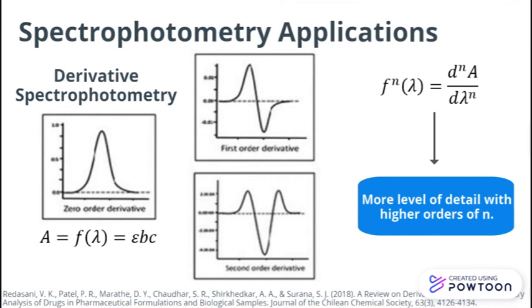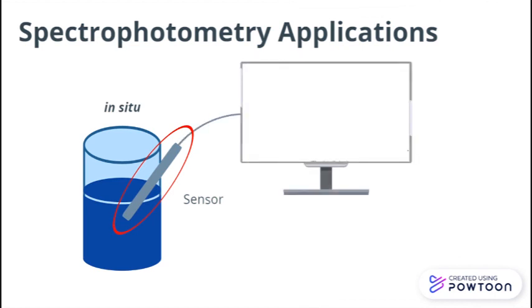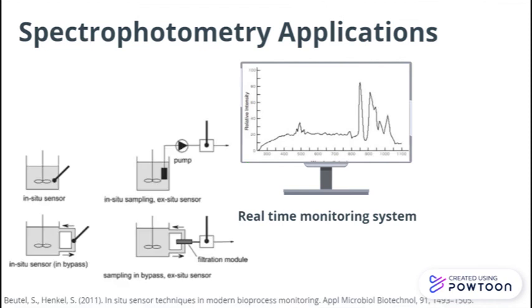Finally, novel in situ applications take advantage of these methodologies as a way for reactor automatization without the need to take and prepare samples from the reactor in specific time intervals.